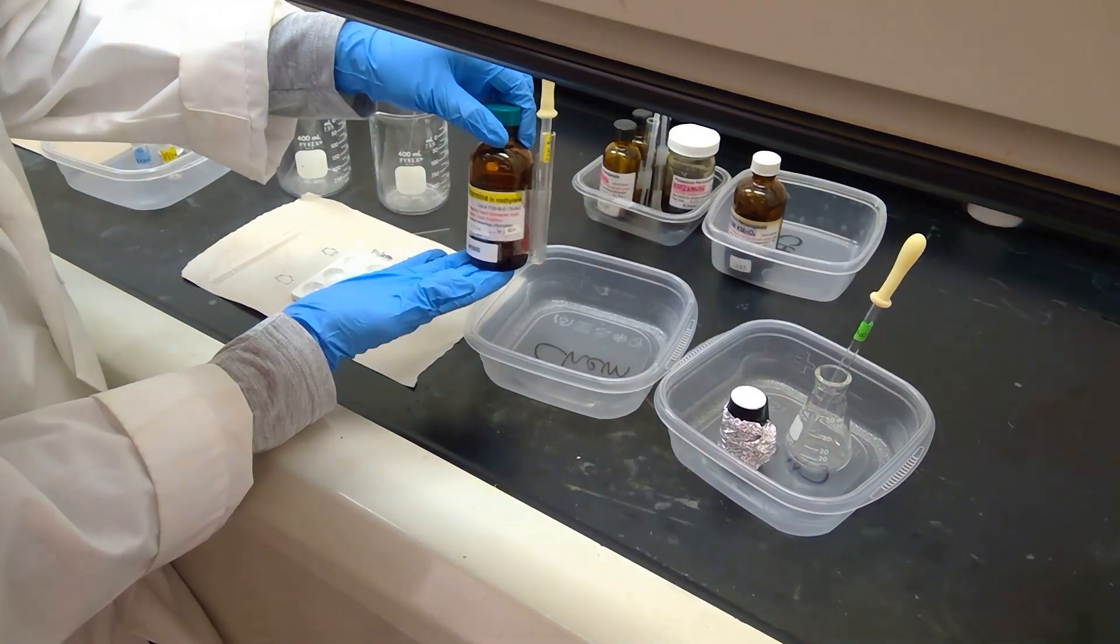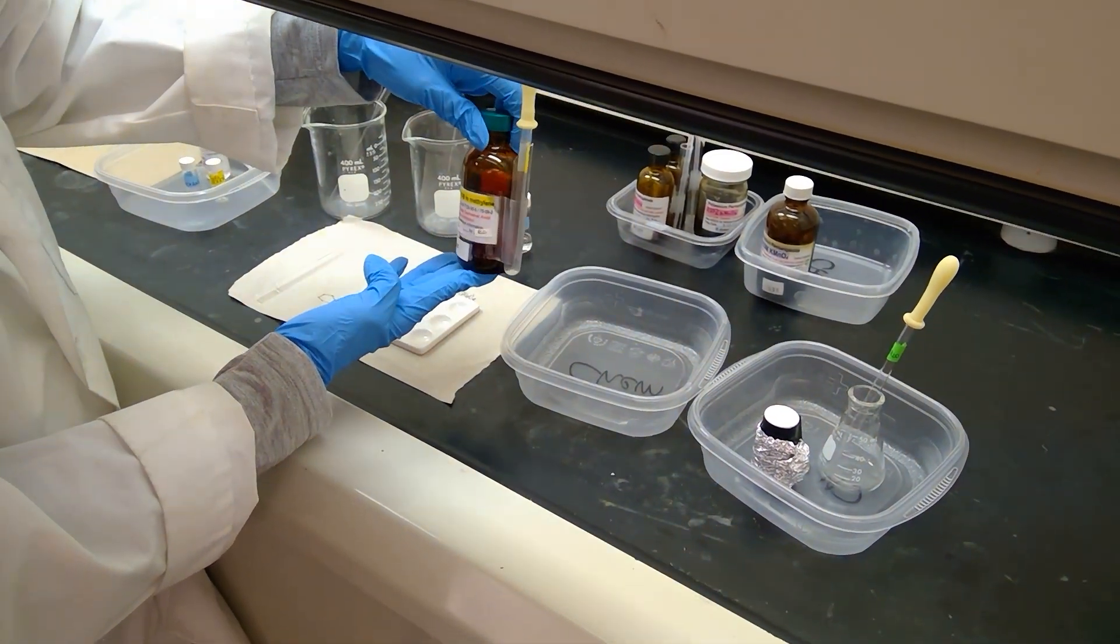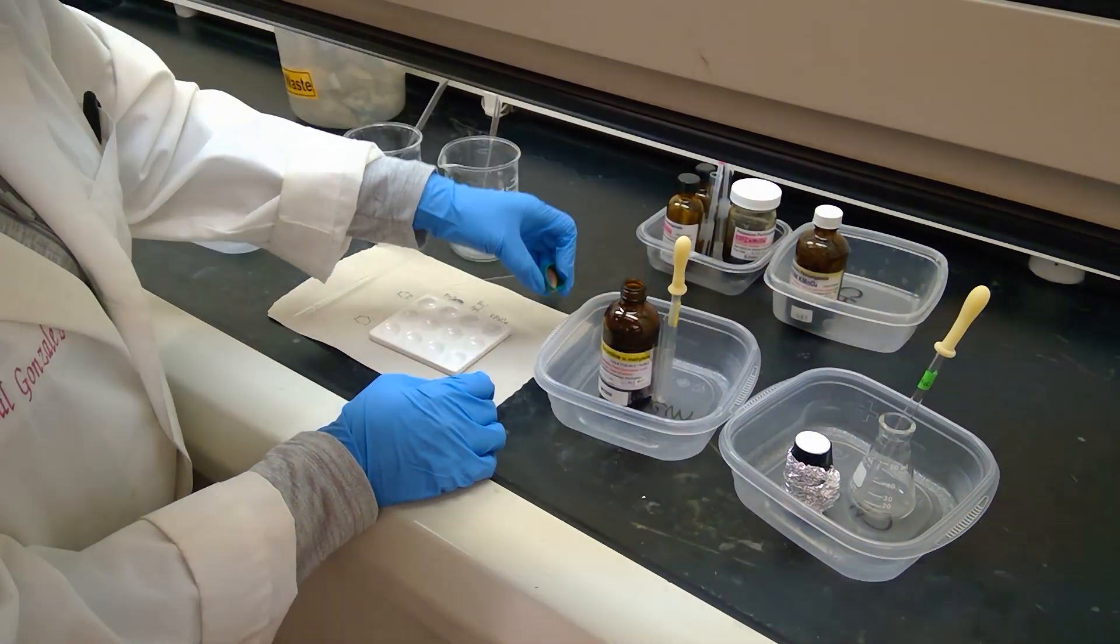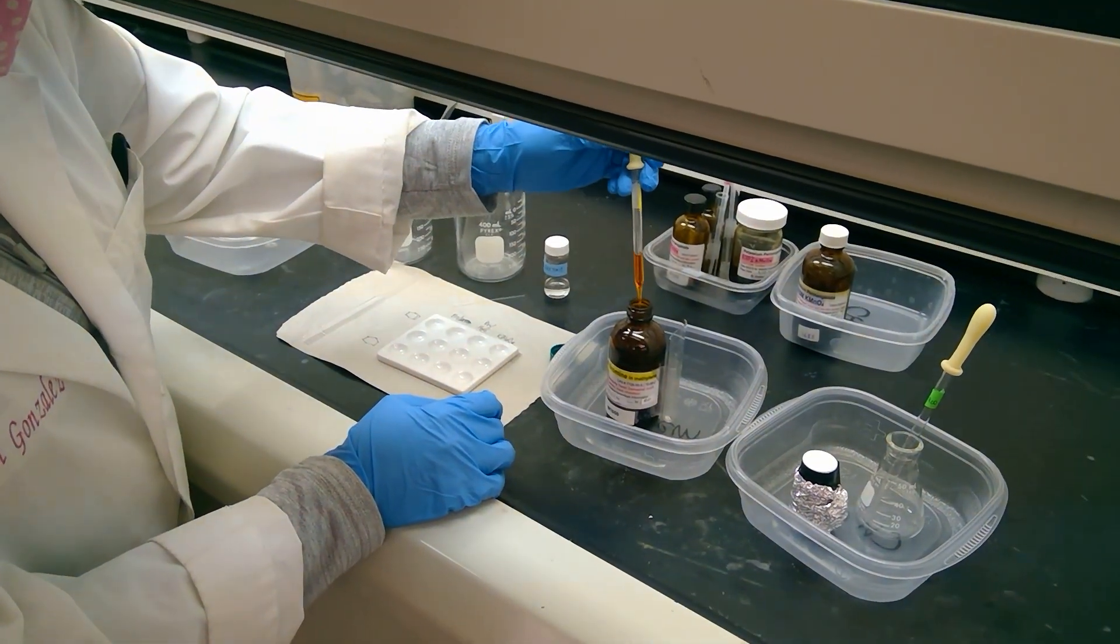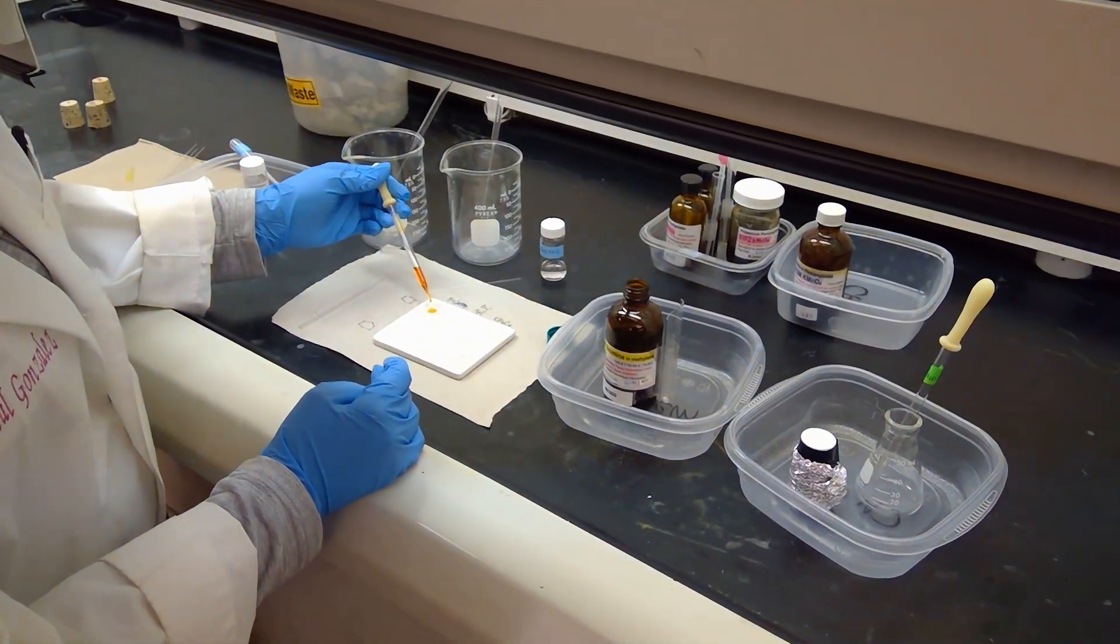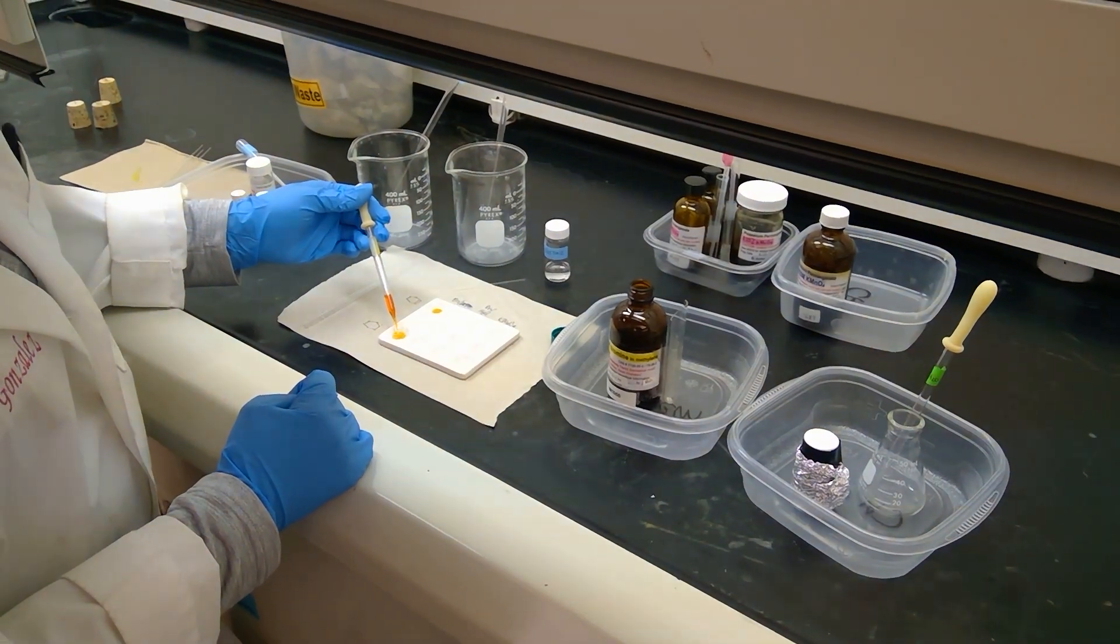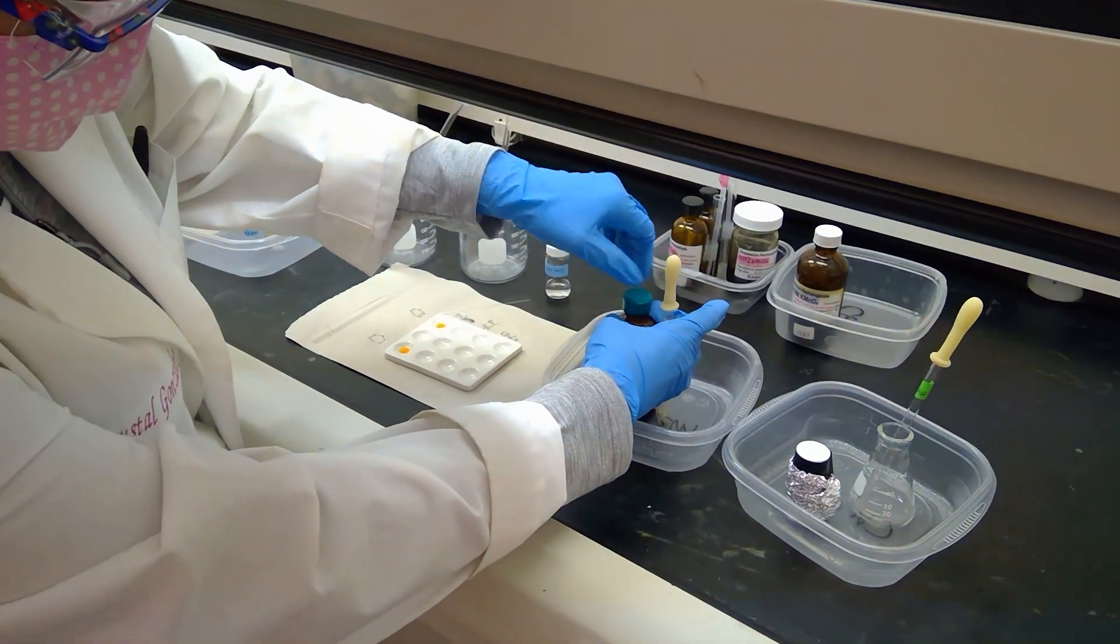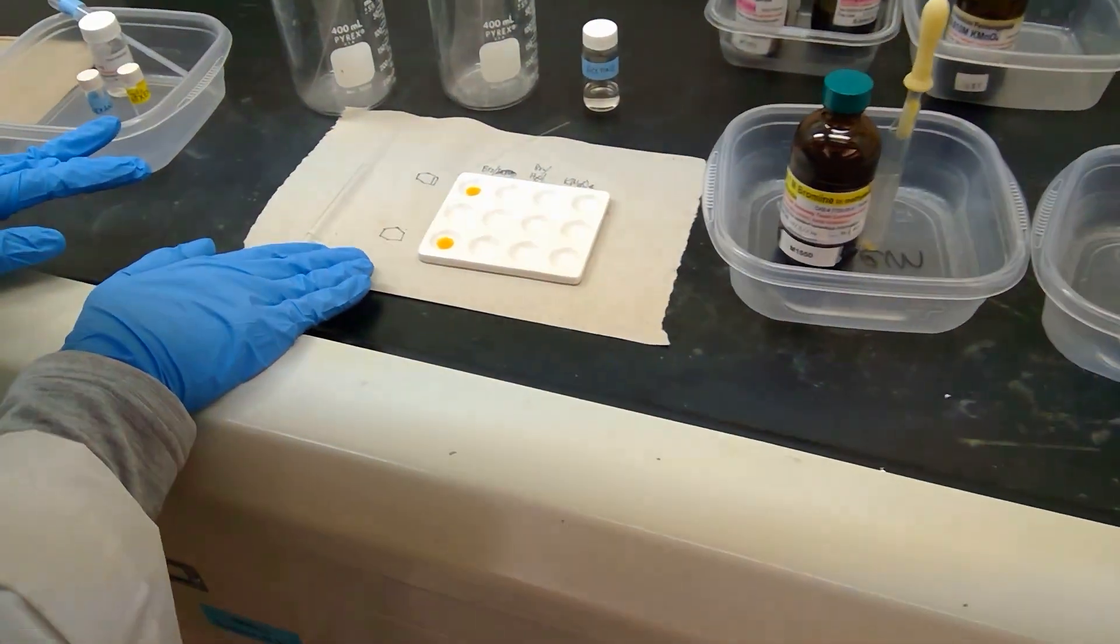Our first reaction is with some bromine here. We have 0.1 molar solution bromine dissolved in methylene chloride. I'm going to take a few drops and place them into my spot plate. Notice our bromine solution is a nice dark orange color. I'm putting five drops into each of my spot plates here.